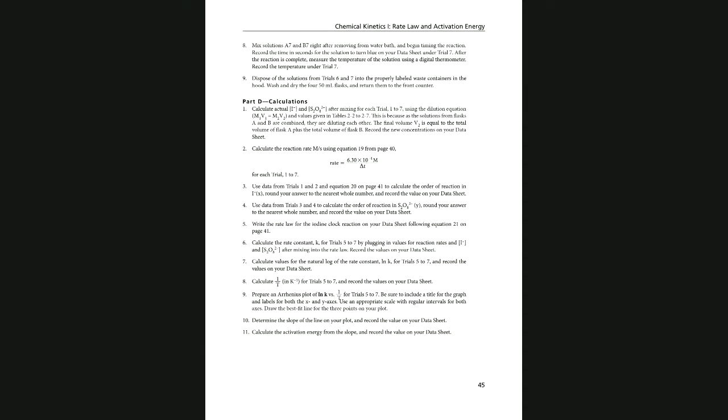Okay, but my major concern today is, because you could all learn about this in lecture, you could learn about this from your professor. The part that you cannot do with not being here is to get those time values. So I'm going to follow the procedure. So I am following the procedure from the experiment 2 in order to perform experiments.